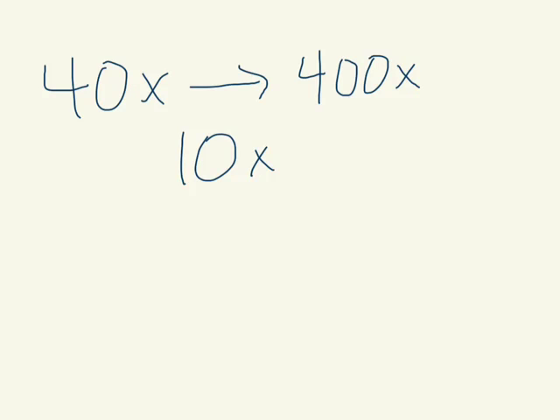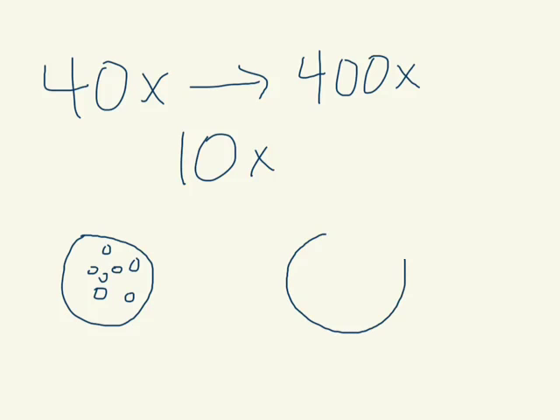So what we did was go from the low powered, and we looked through this, and what we saw was cells that looked like this. And when we moved up to the high powered objective lens, maybe we saw something like this. Now my question is, did the cells actually get bigger? Well, no, we just got closer.